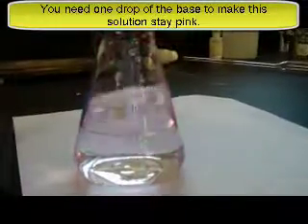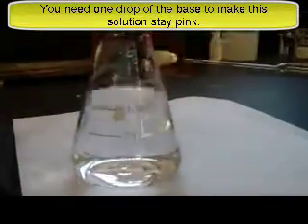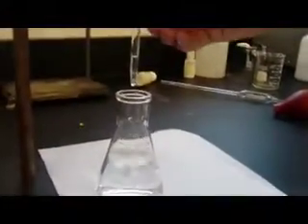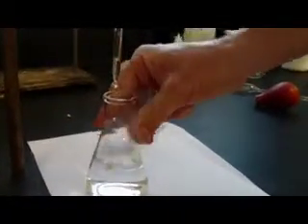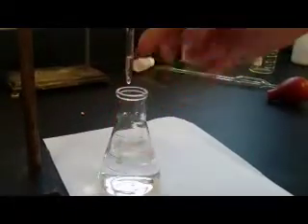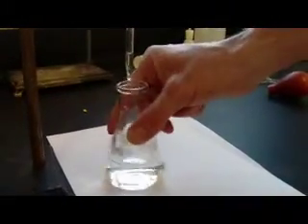Okay, so right now I've just got a few drops dripping into the container, and you'll see that as they drip in, we've got a little pink spot on there, but when I swirl it, whoop, it goes away. Now we're getting close because the pink is starting to stay a little bit longer, so I add a few drops, and it's pink, I swirl, it goes away. So the idea is that you want to add enough so that when you swirl, the pink stays for at least 30 seconds, and you really only want that to happen with the addition of one drop.